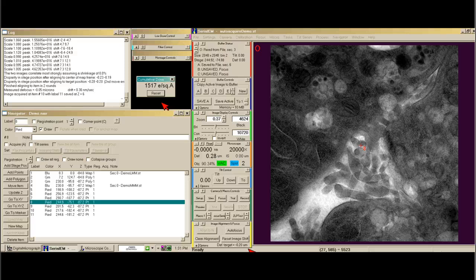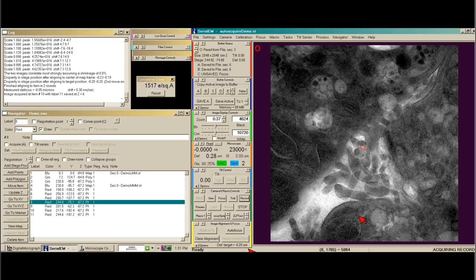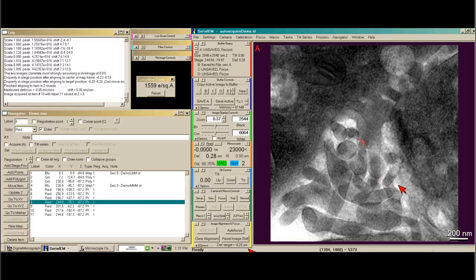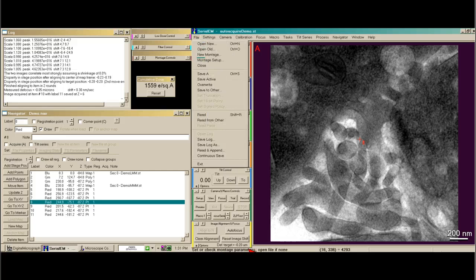Let's go to a mag of interest. Usually we image at a 1 nanometer pixel size, which for us is 23,000X. I'll take a record image just to see what it looks like. We're way out of focus, but we're still on our area of interest. I'm going to close this file.